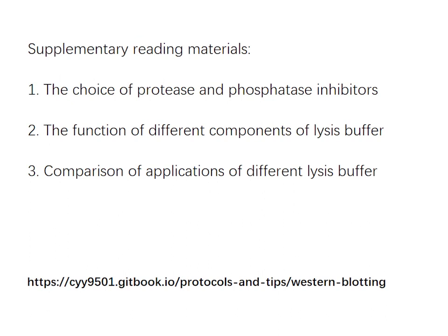Due to the limitation of the video length, I put the supplementary reading materials to this page. There is a brief review about the choice of protease and phosphatase inhibitors, the function of different components of lysis buffer, and comparison of applications of different lysis buffer.